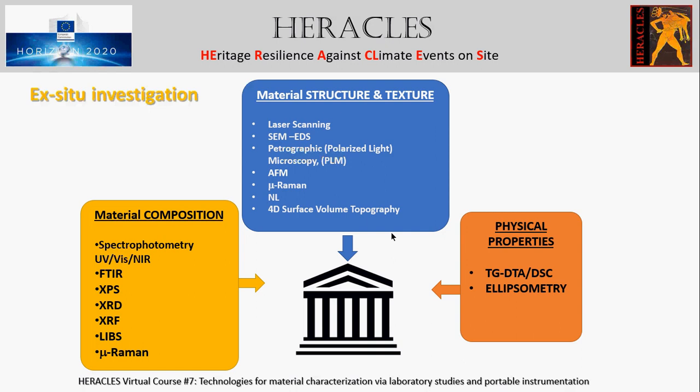The small amount of sample and its high spatial resolution allow the identification of micrometric mixtures of compounds which constitute the samples, the determination of minor trace compounds resulting from weathering and degradation phenomena, as well as the characterization of existing restoration works. This technique is considered non-destructive and the sample recuperation is full.